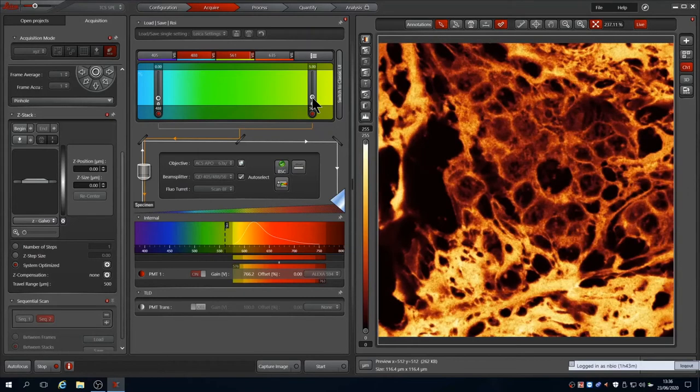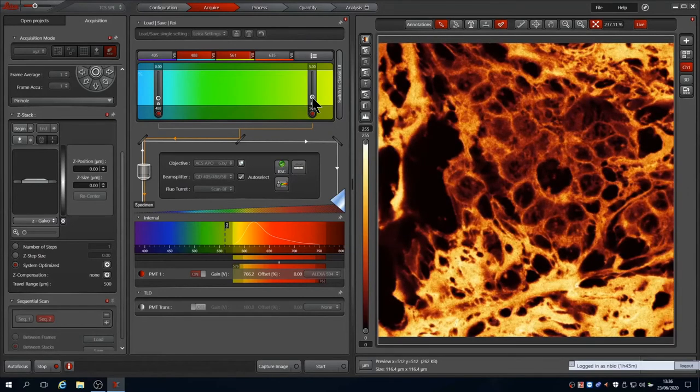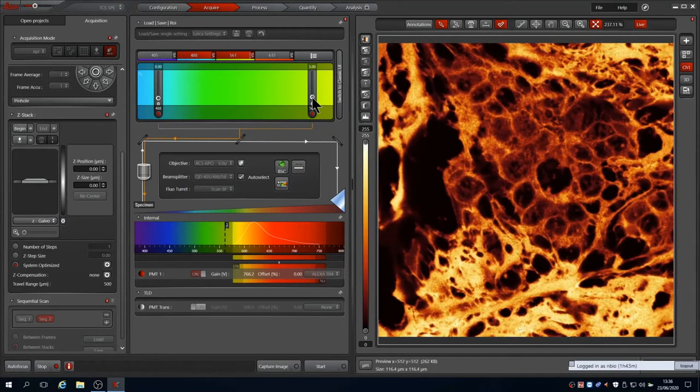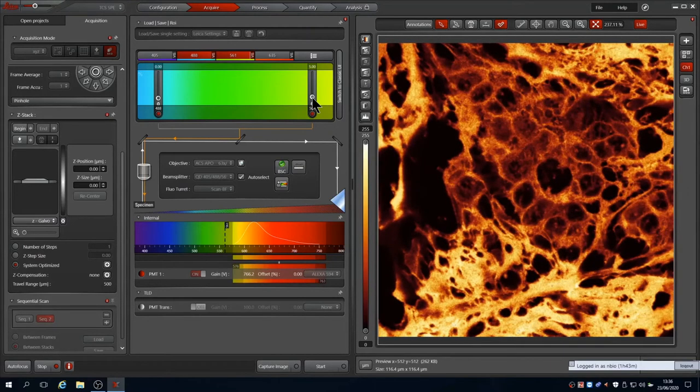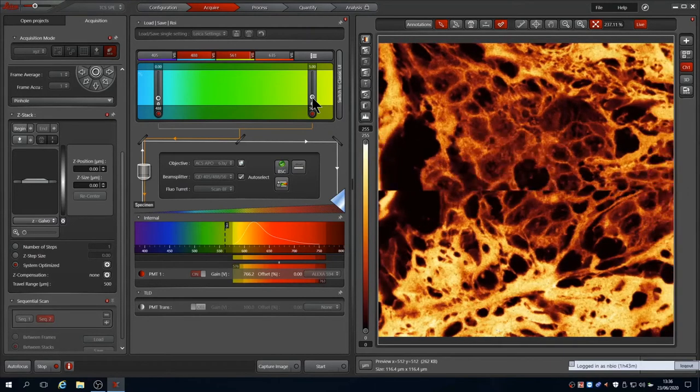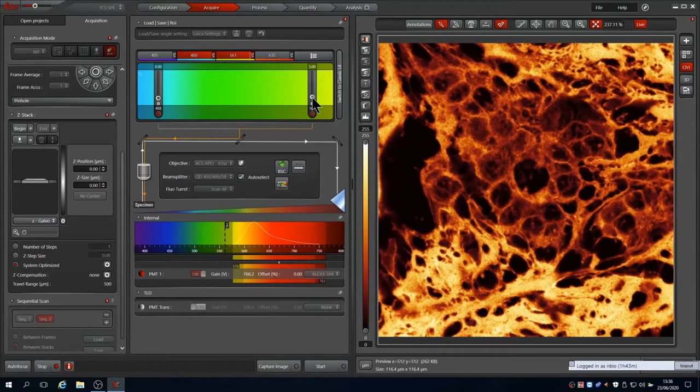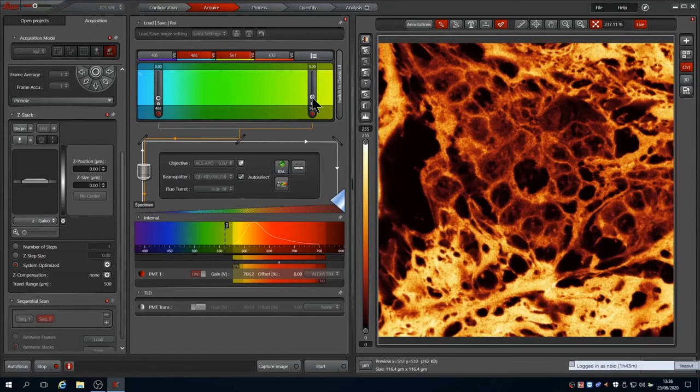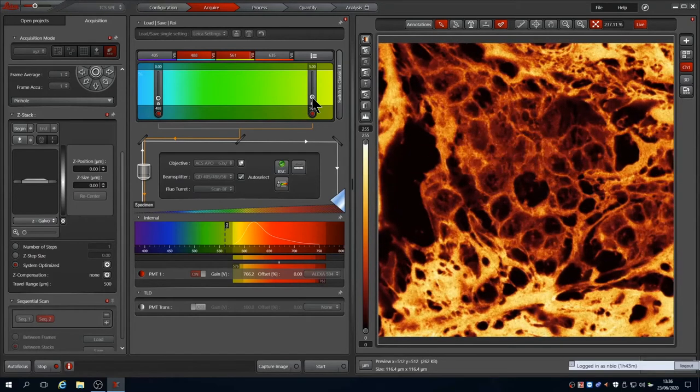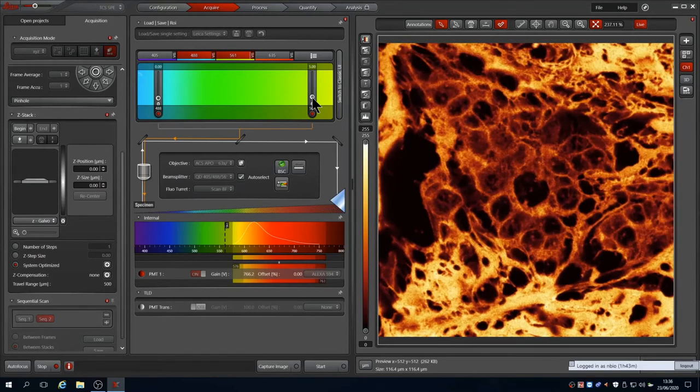Reset the range back to full and then continue to adjust the laser intensity to optimise the signal range captured. How much of the dynamic range you want to fill depends on the range you expect from your experiment, as well as sample sensitivity to light. Here we have a good image with 5% laser power.